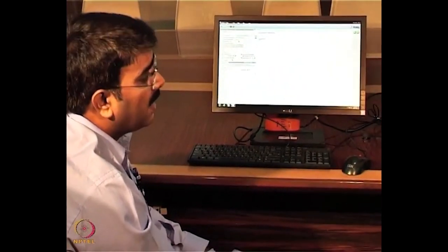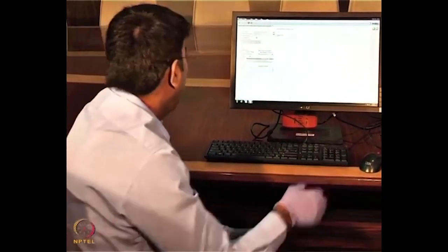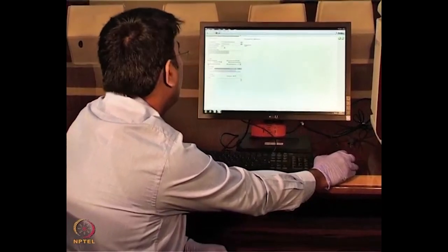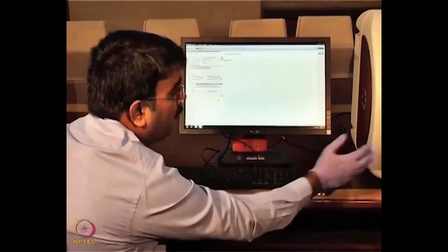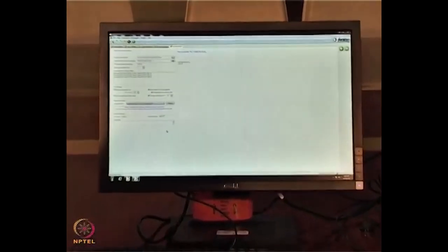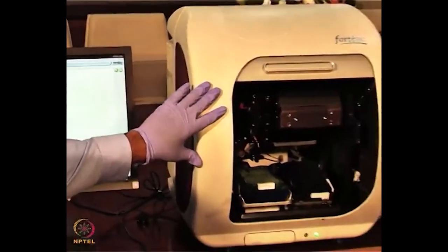In some cases it is required, some cases not. You know that shaking sometimes enhances the aggregation. So we can uncheck this, and also prior to the experiment we already started a hydration of the sensors. Now the sensors got hydrated, we can directly uncheck this and go for the experiment. And the sample plate temperature is at 30 degrees, so that plate is already stabilized, we can now go for the experiment. Here, if you look at this, I opened the door for the demonstration purpose.